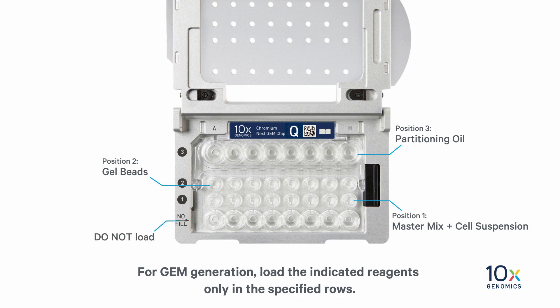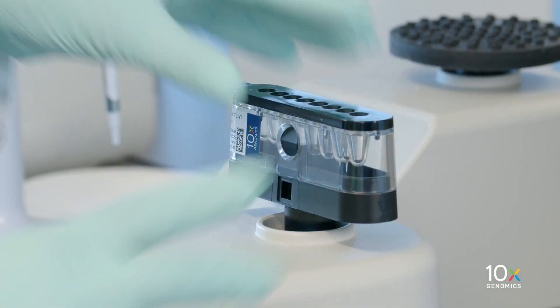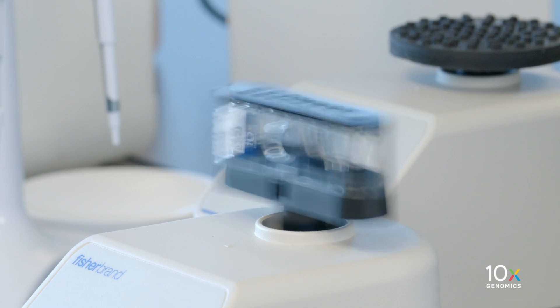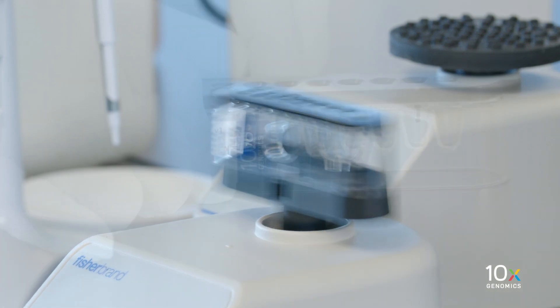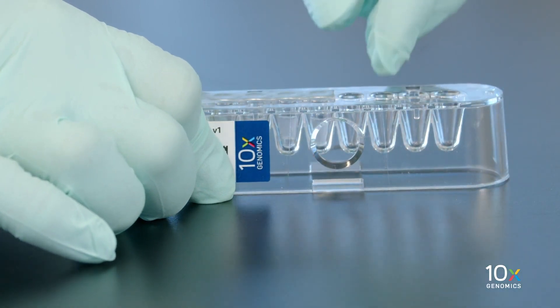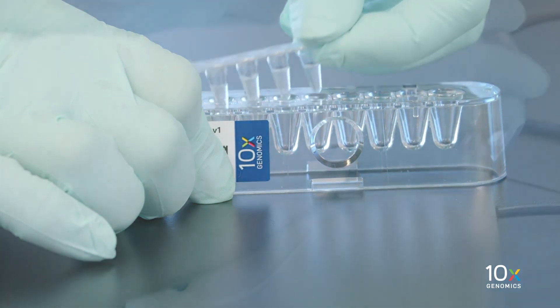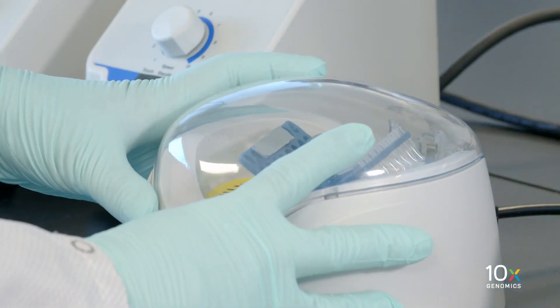Next we will prepare the gel beads. Snap the tube strip holder with a gel bead strip into a 10x vortex adapter. Vortex for 30 seconds, then centrifuge the gel bead strip for approximately five seconds.